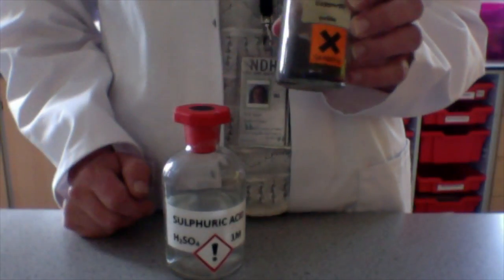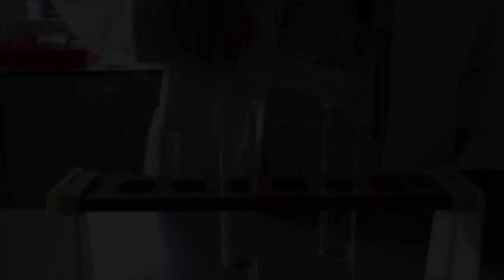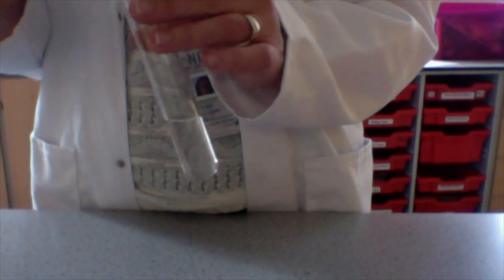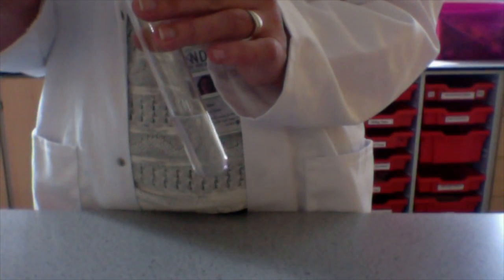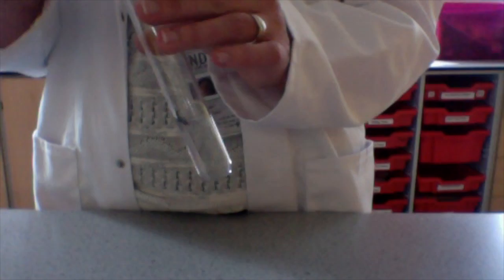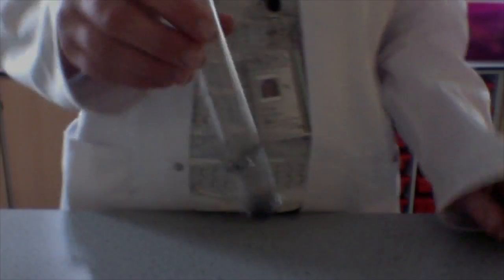So copper oxide, a black powder. Now again, we've got a colorless acid here and I've got a black powder I'm sprinkling. So I'm using a spatula here. I'm adding a sprinkling only of the copper oxide. There we go.